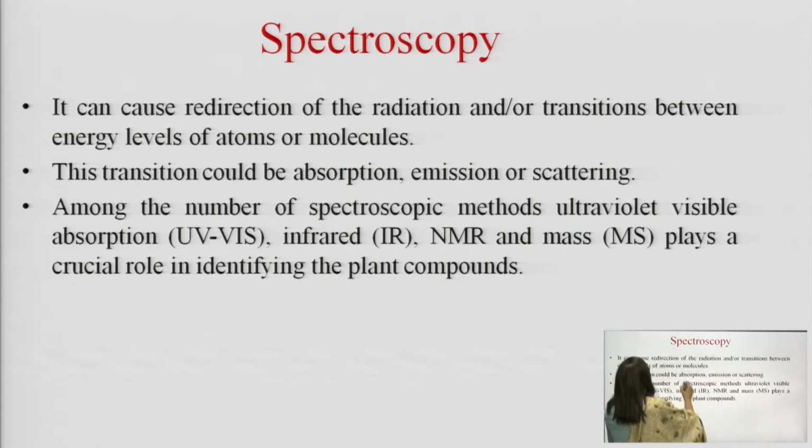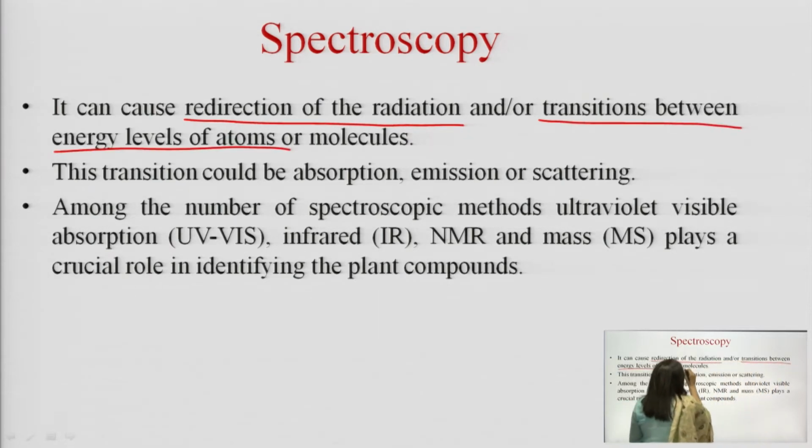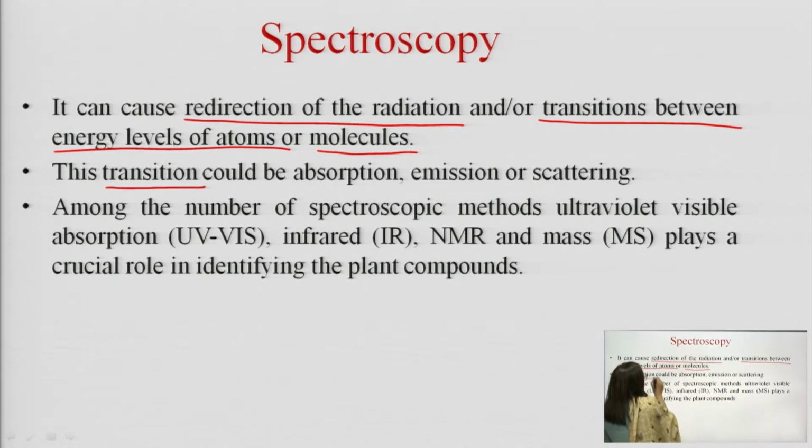It can cause either redirection of these radiations or transition between the energy levels of the atoms or molecules. This transition could be either absorption, emission or scattering.